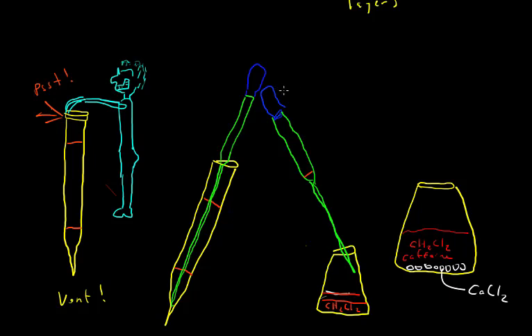I always say this, and what I often see students do is they'll add 2 milliliters, shake it up, add 2 more milliliters, shake it up, and then add 2 more for a total of 6 milliliters in here, if you even have enough room for that. That's not 3 separate extractions. That's 1 extraction with 6 milliliters, which is not as effective as 3 separate extractions where you separate each of those 2 milliliters and then add more. So make sure you understand that.